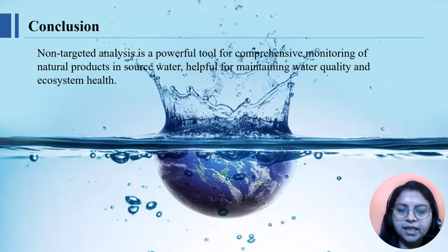Now we are at the end, and you can say that non-targeted analysis is a game changer. It enables a more comprehensive understanding of the natural products in source water and the DBPs they might form. This is critical for maintaining both water quality and ecosystem health.